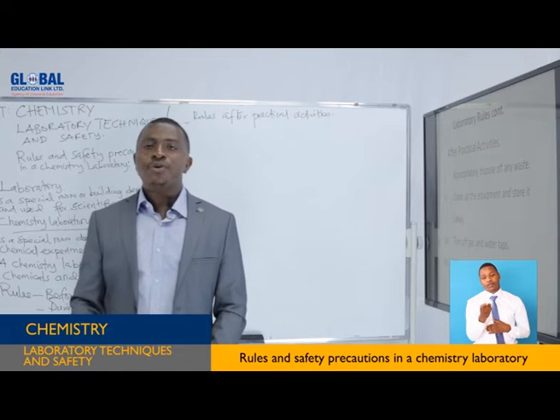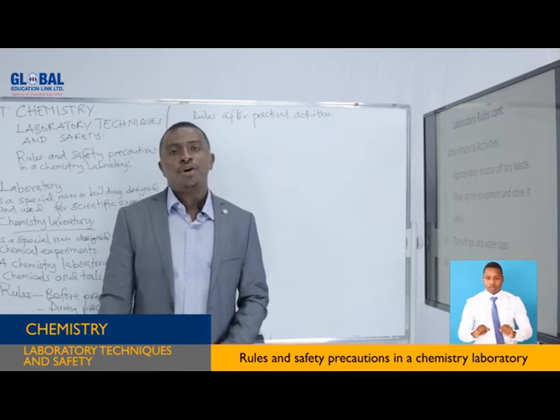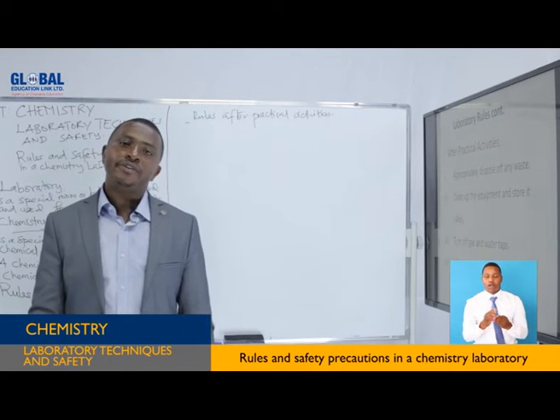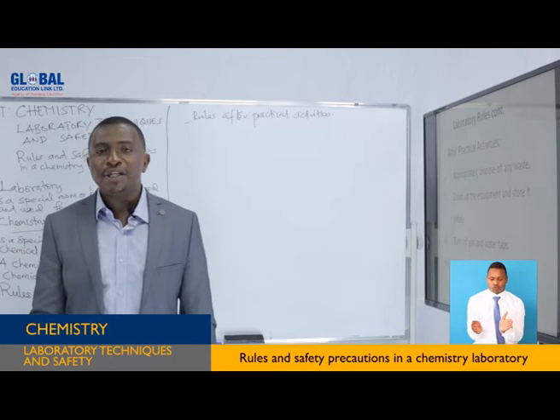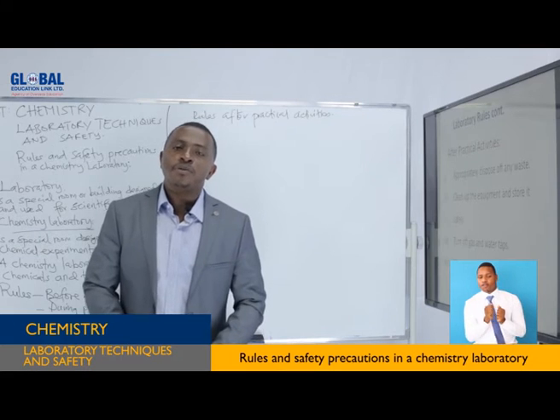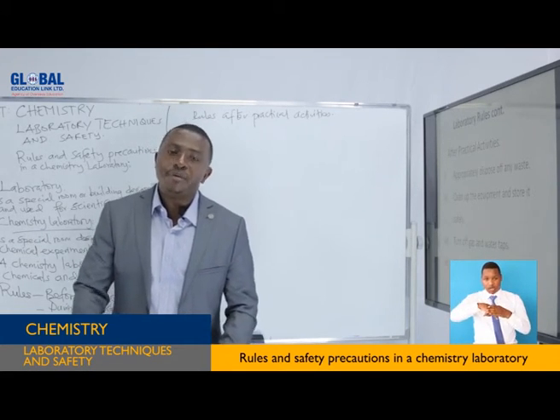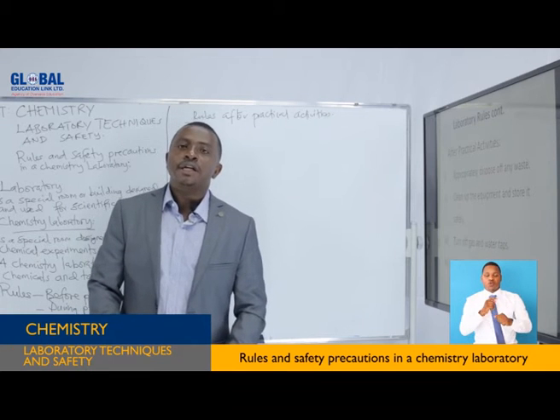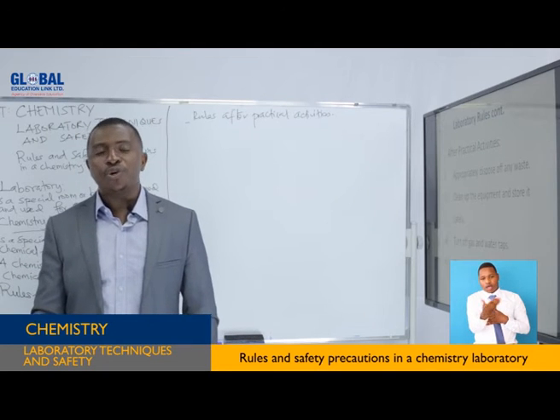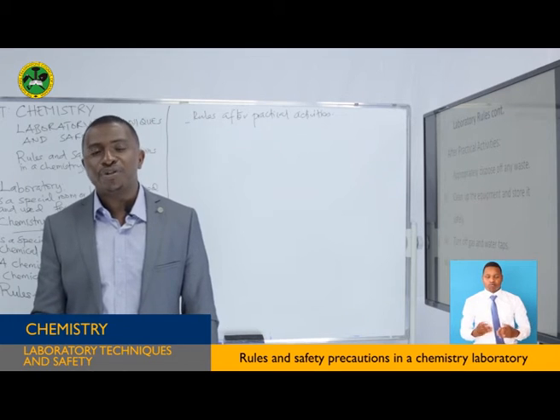Please, after conducting your practical activity, you are required to clean all the apparatuses and store them very safely. Cleaning the apparatus removes the chemicals that were used in it. So when you clean the apparatus, you make it safe for the next experiment, so that even when someone comes and takes the specific apparatus, they will find it clean.